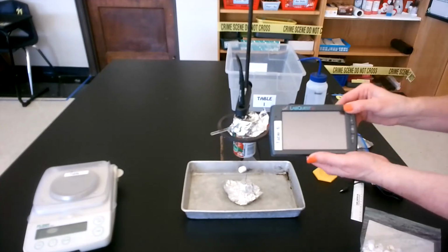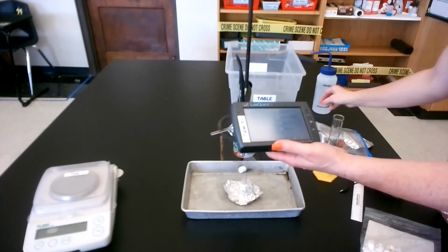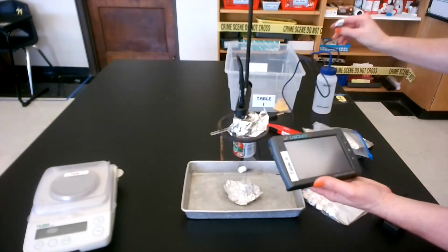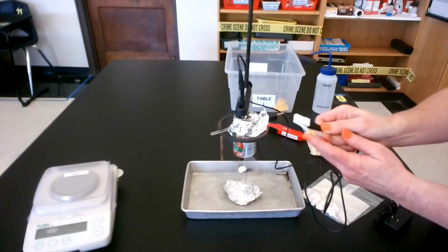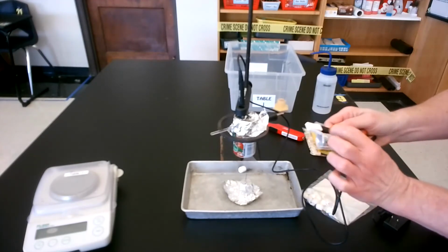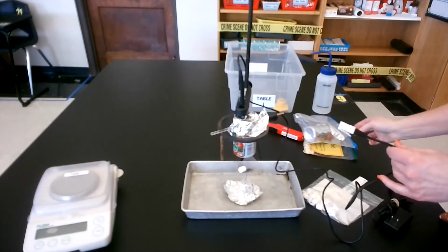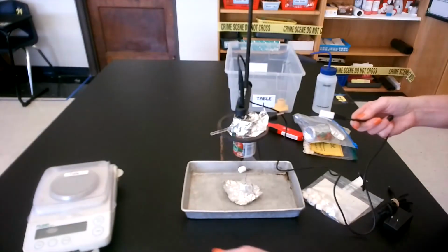Now, for the LabQuest, on this one, the button is on the top, so I'm going to turn it on. Give it a second. It takes a little bit of time. You may need to take the charger and plug it in if it loses its charge. So this is a different connection, okay? We have this little white spring-loaded clip. This is plastic. If you're not careful and this breaks off, you have to throw the whole thermometer away. It's really crazy because it won't stay inside the LabQuest. So when taking it in and out of its bag, here's the bag, just be careful, okay?